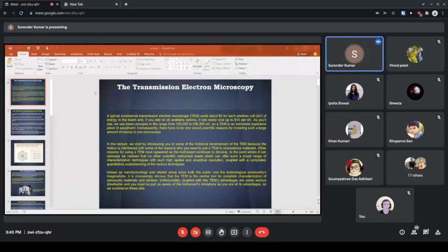You can see, for example, a nickel based superalloy. So you have nickel L information. Then you have aluminum, since it is a superalloy, so it has aluminum also. Here you can see at 5 kiloelectron volts some information about chromium K alpha.